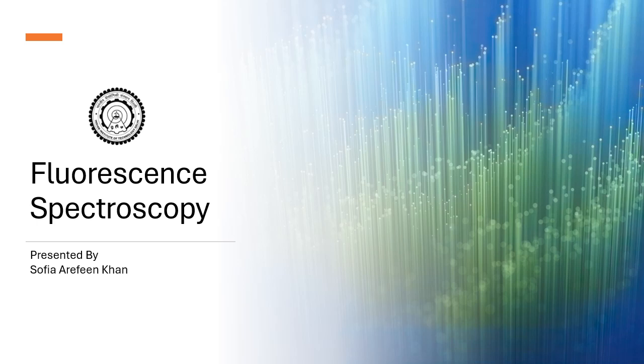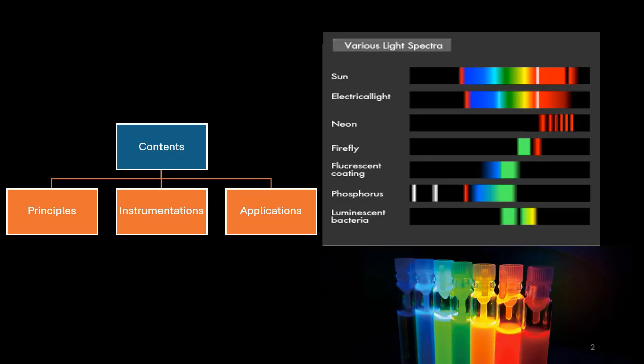I'll start from the very basic principles of fluorescence and then I'll go through the instruments used in this technique. These are the major divisions of my presentation, which are the principles, instrumentations, and the applications.